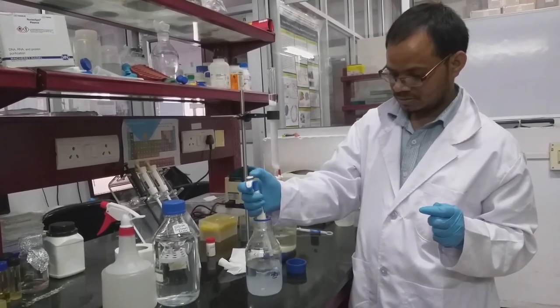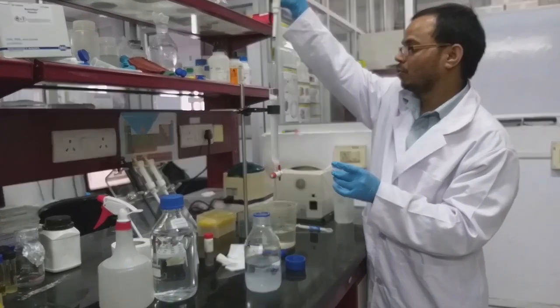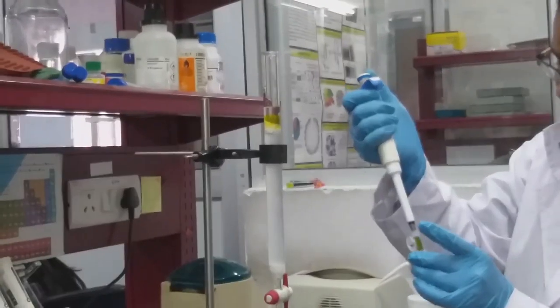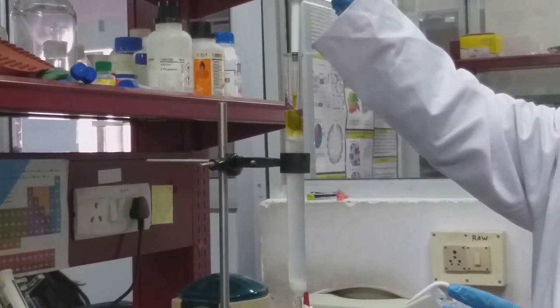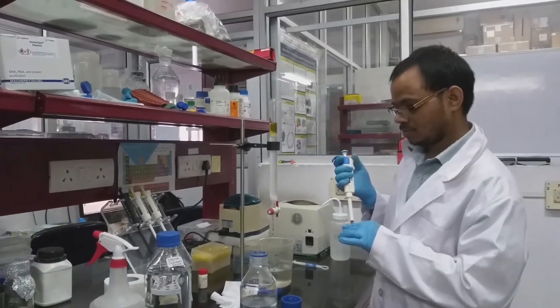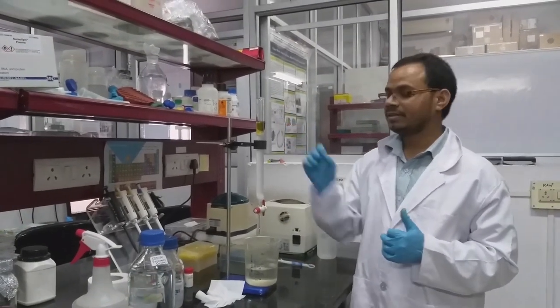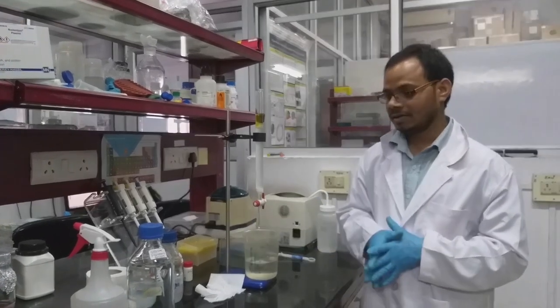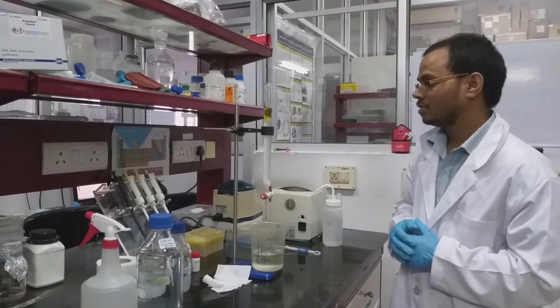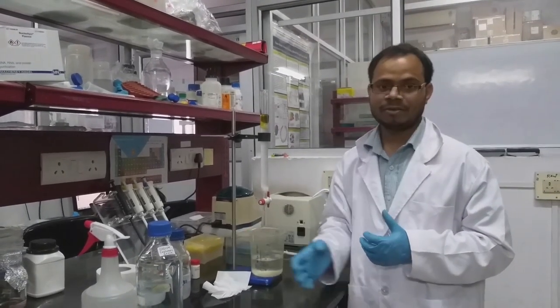I will add the beads to the sample, and this sample I am going to load on top. Now let this settle, then we will keep replenishing with the phosphate buffer. So what happens is the blue colored compound elutes first, and the yellow one stays for some time, retained by the particulate gaps, then it will elute upon addition of extra buffer.